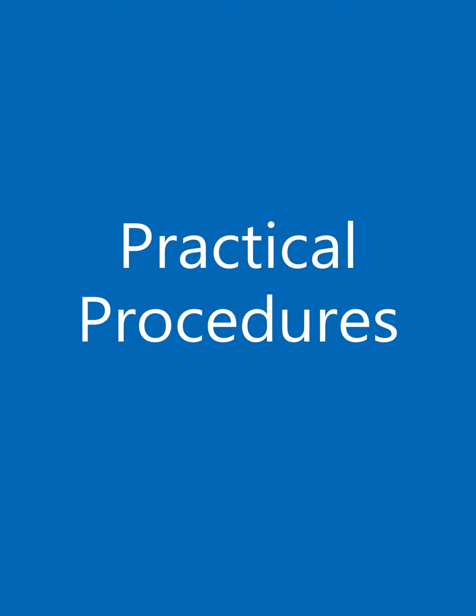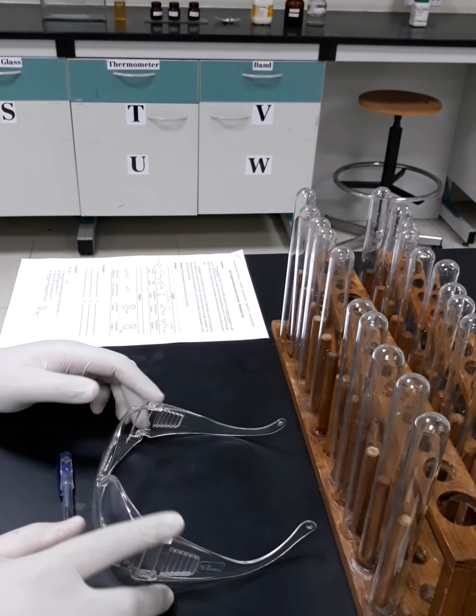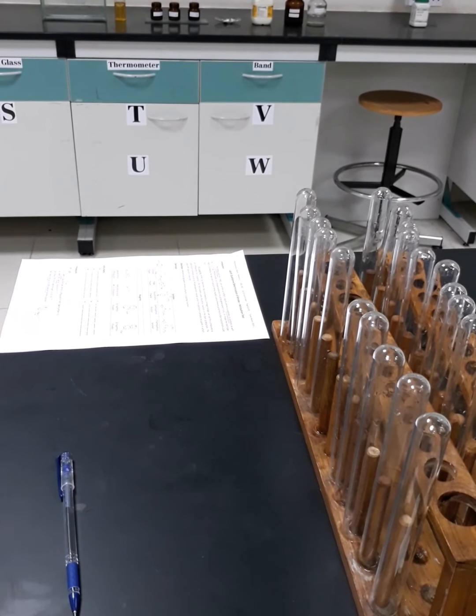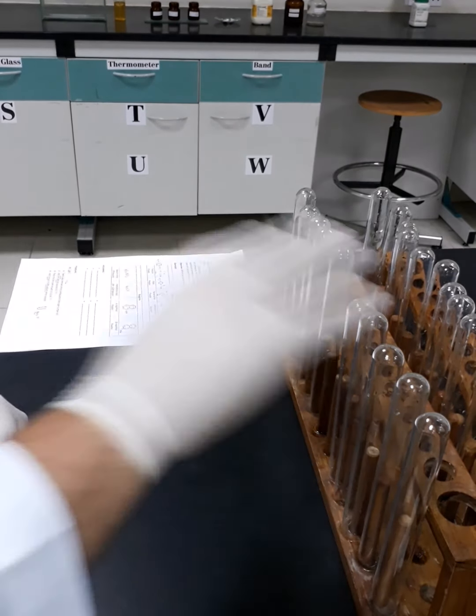Now we are going to proceed, but before that we have to make sure that we have all the personal protective equipment, including the gloves and the goggles. So let's start. To make our life easy, we will start by labeling the test tubes.